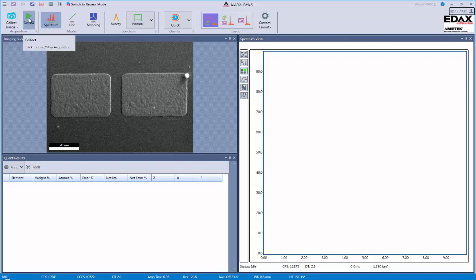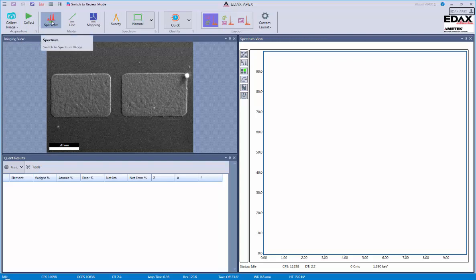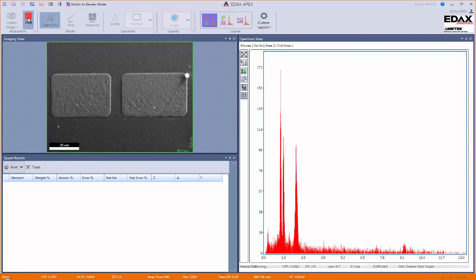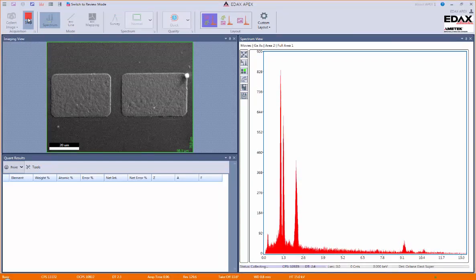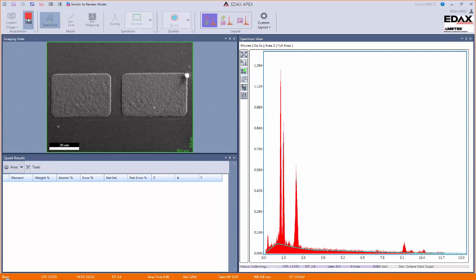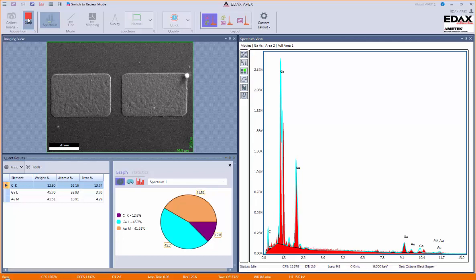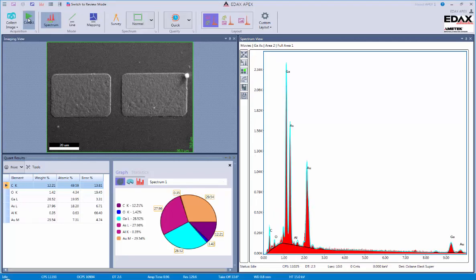Next, we could collect data. Now, this collect button is always going to apply to whatever the active mode is. So, for example, now we're in spectrum mode, so when I click on collect, it will collect the spectrum for us. And about five seconds in, we get our automatic peak ID. And now that's stopped automatically for us based on our quality setting.